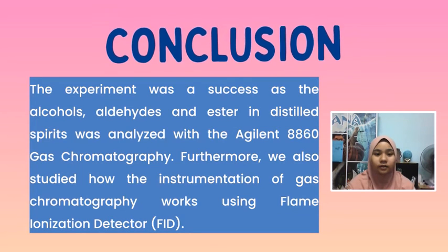In conclusion, the experiment was a success as the alcohols, aldehydes, and esters in distilled spirits were analyzed using the Agilent 8860 gas chromatography. Furthermore, we also studied how the instrumentation of gas chromatography works using FID.